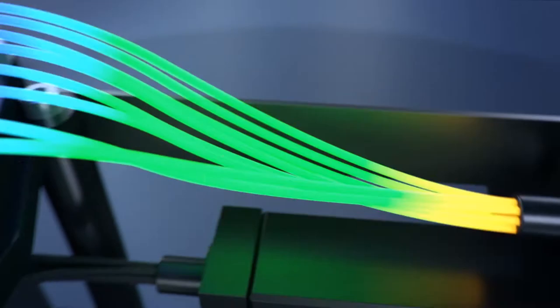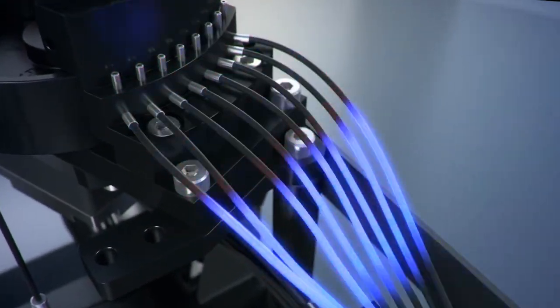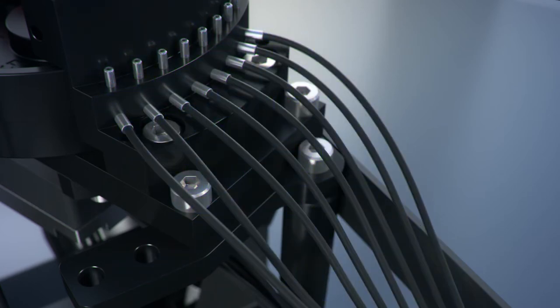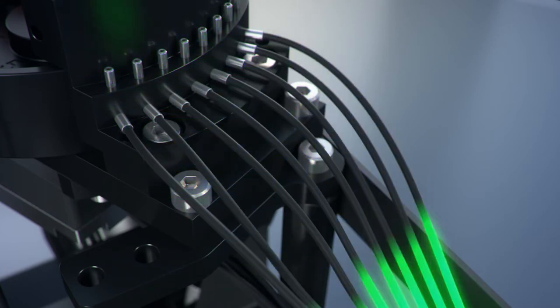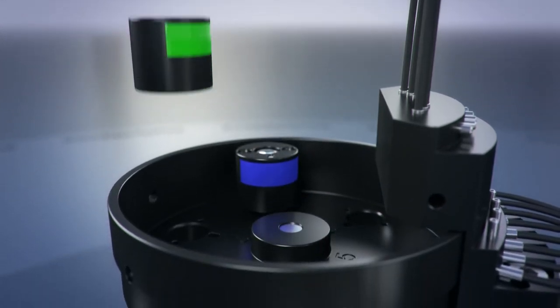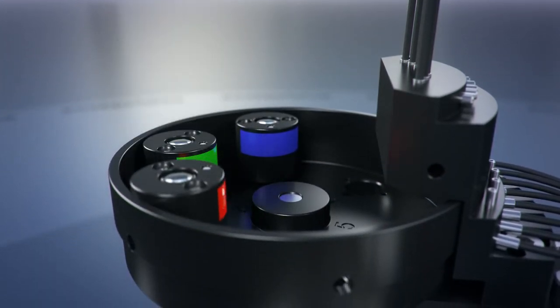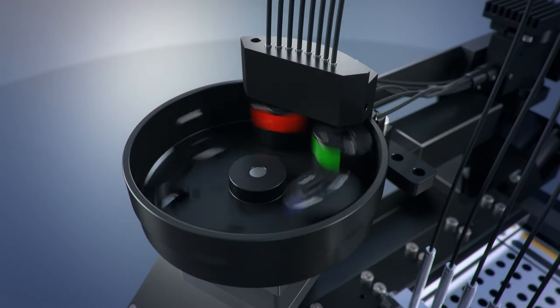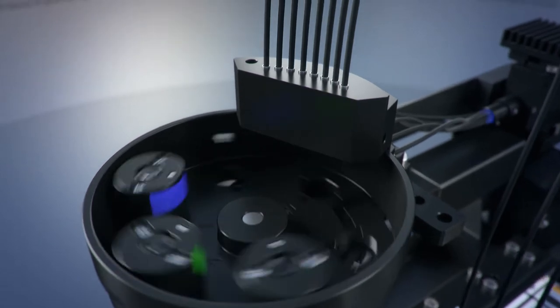The heart of the patented highly sensitive fiber optics is a unique light source. Four high-power LEDs optimally excite every fluorescent dye in each individual well without any lamp warm-up time. Selecting the right excitation and readout wavelengths is facilitated by a variety of filter modules. The module wheel can be equipped with up to six different color, FRET, or protein modules which are exchangeable within minutes, making Q Tower 3 easily adaptable for future applications.